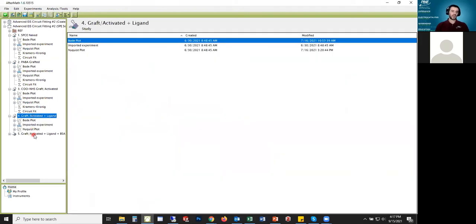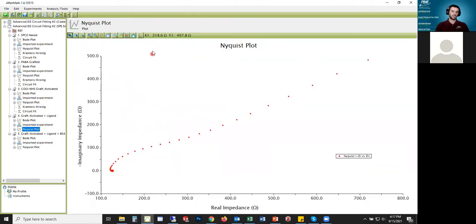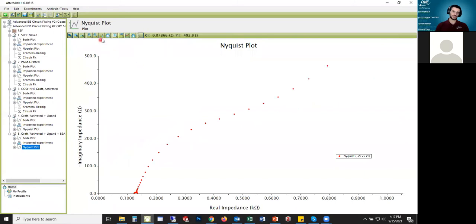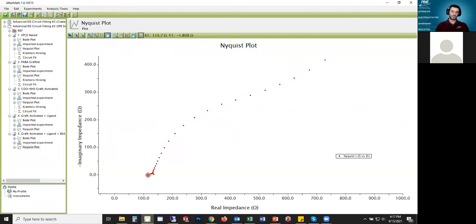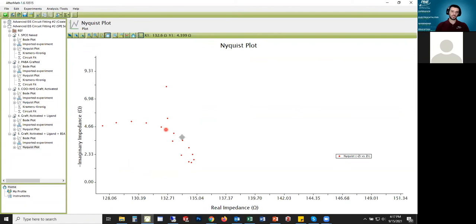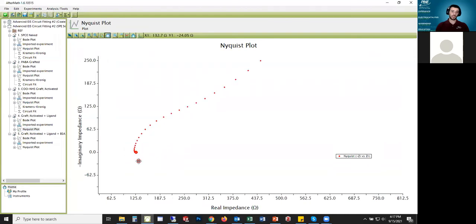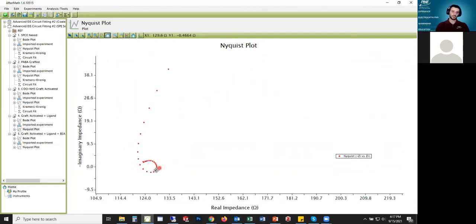So steps four and five again were the ones really of interest. And on a large view you see it kind of just looks like a semicircle with diffusion, almost basically just something as simple as that. But when you zoom in at the higher frequency you see this loop. So some of you may be familiar with this kind of phenomenon or you may have seen data like this or you may have data this yourself. This loop here, so what's going on with this high frequency loop?